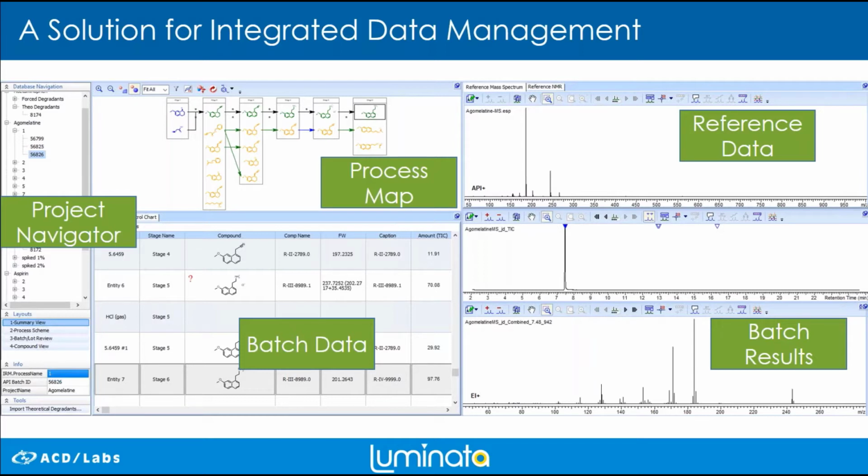Finally, your control chart. Now, the control chart aspect is more about batch assessment and risk assessment, and that's something that I'll cover in today's afternoon session.